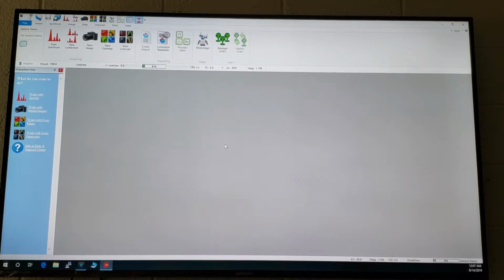But okay, so basically this screen right here is the same as that one, right? And we're sharing the display, so the mouse will go from the SEM and extend over to here, so that's great. Just make sure you don't lose your reference to where it is.